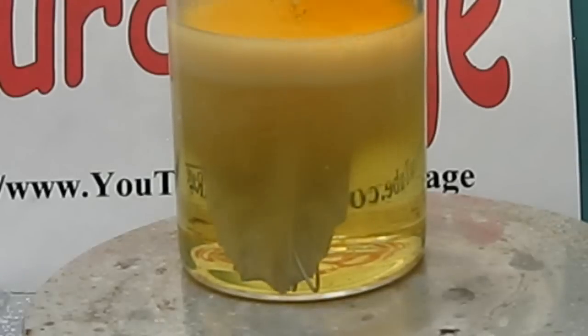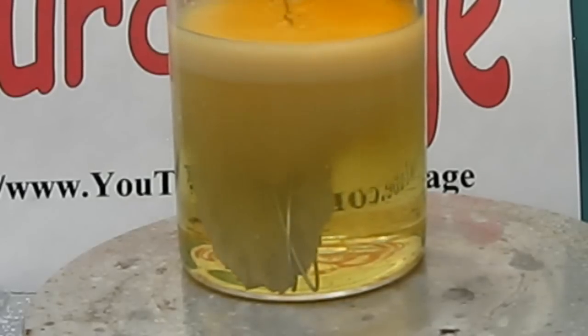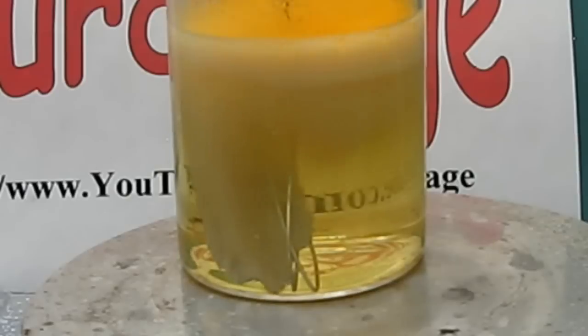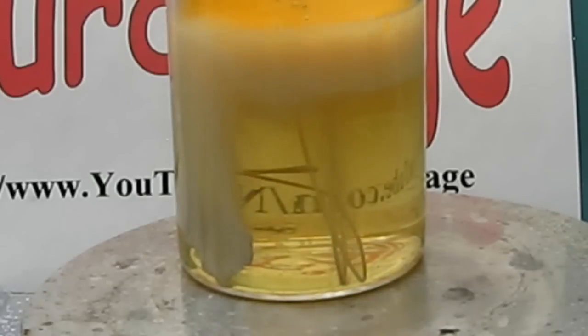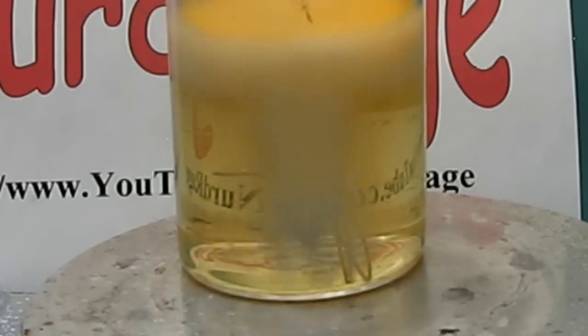Needless to say, the acid itself is also very dangerous, so wear gloves when working with it. The aluminum wire is doing a very good job of resisting the acid. This is because aluminum creates a layer of aluminum oxide when exposed to concentrated nitric acid, and the oxide layer resists further attack by the acid.